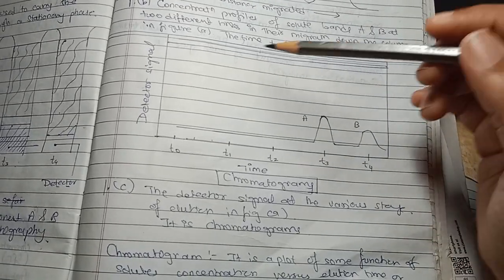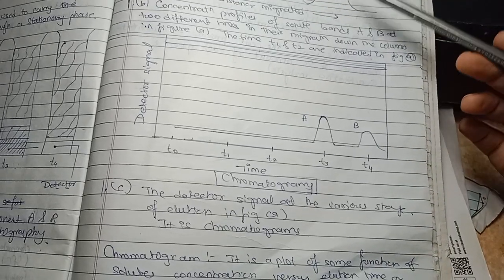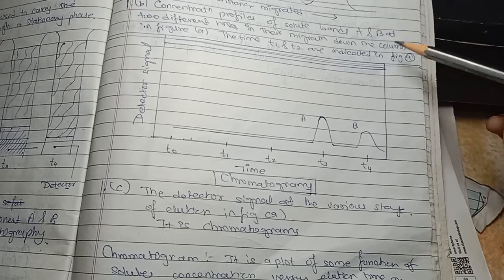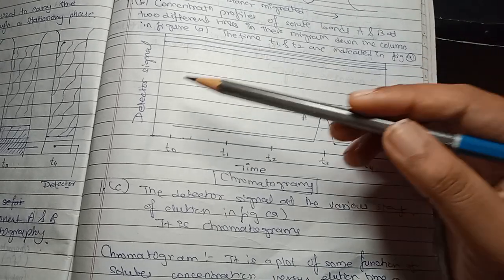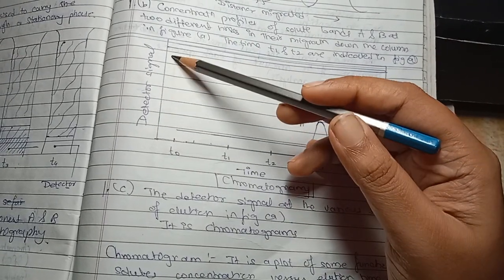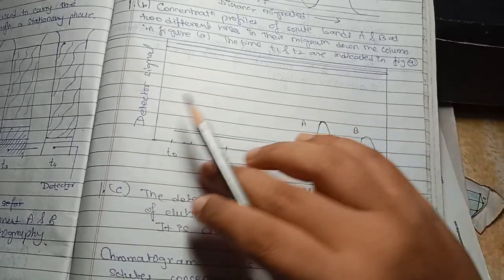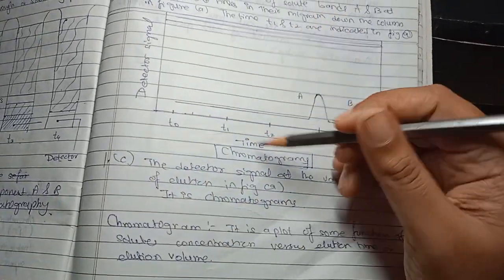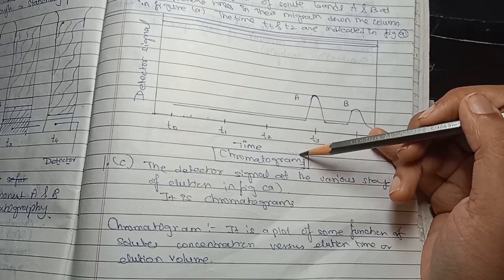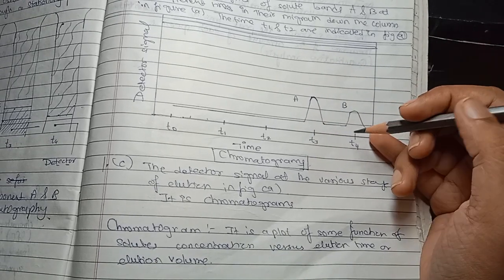Now this graph is very much different than the earlier graph. Here the x-axis is the time and the y-axis is the detector signal. So what does it show here? This graph is also known as a chromatogram. That means this graph is produced after the complete elution in column chromatography.